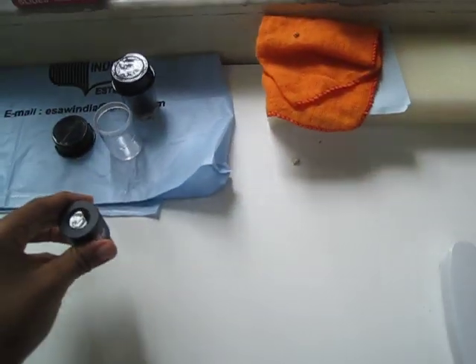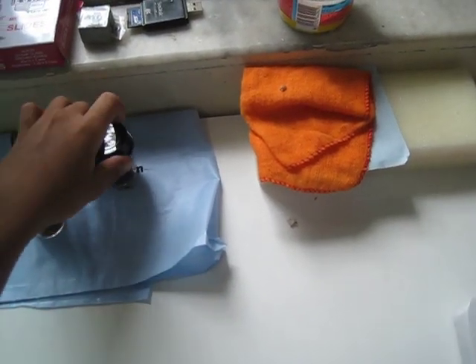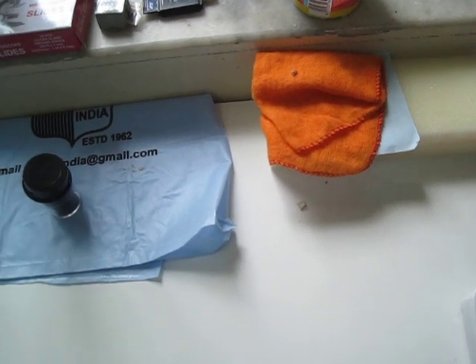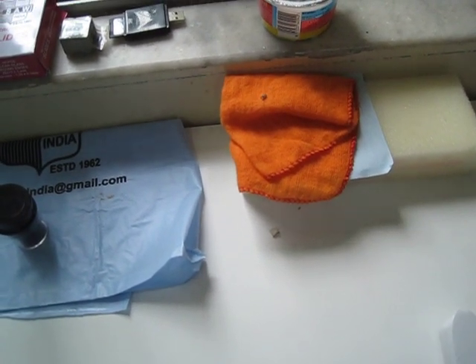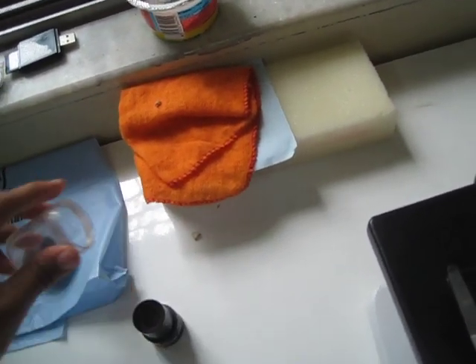So let's try another eyepiece. This is the 15x wide field eyepiece. Wow, look at this!